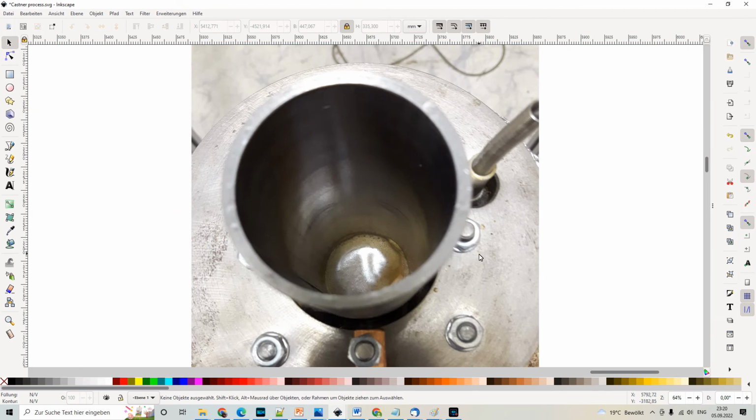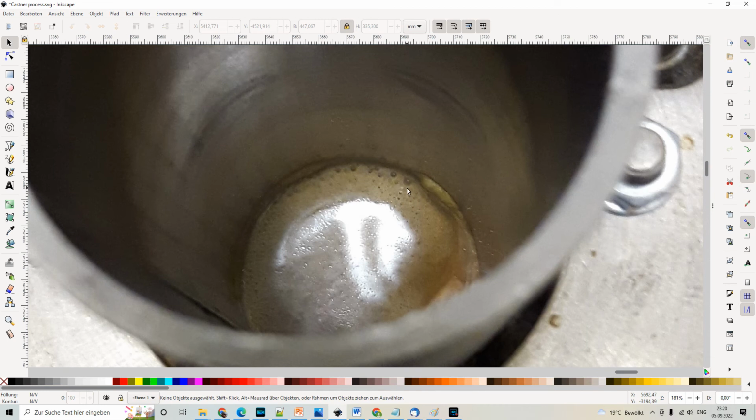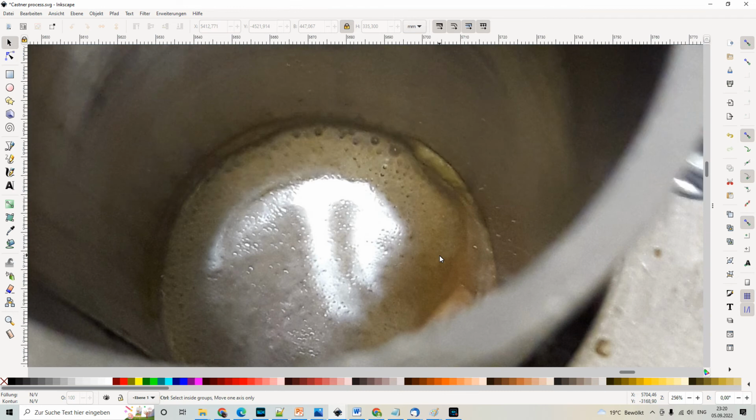So this is one of the few pictures from the cell being in operation. When we zoom in here, we can clearly see the bubbles which are caused by the hydrogen coming up here. And if we have a closer look, then we also see some small sodium globes. So here, for example, and here. But there are actually much more sodium globes. They are just hiding behind the hydrogen bubbles. So if you wait a little bit, scoop in, get that stuff out, then you're having some sodium for sure.